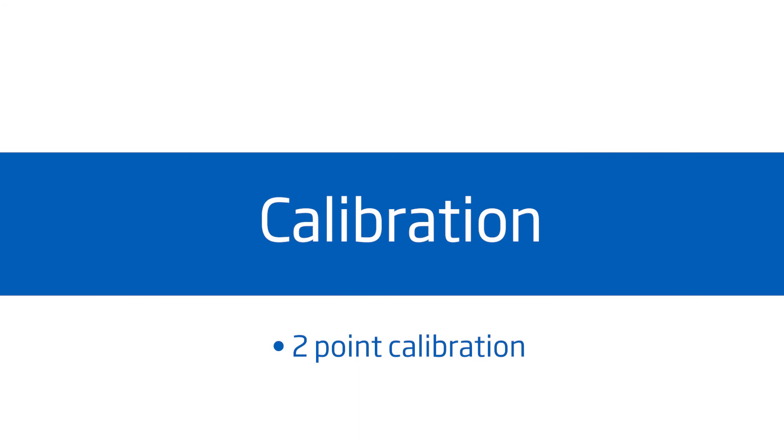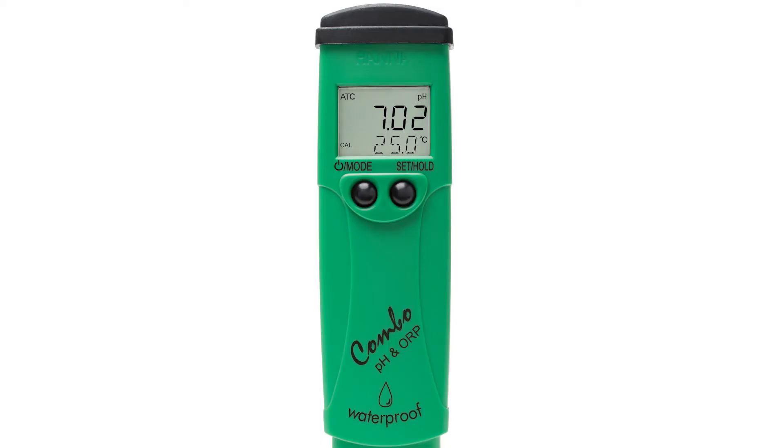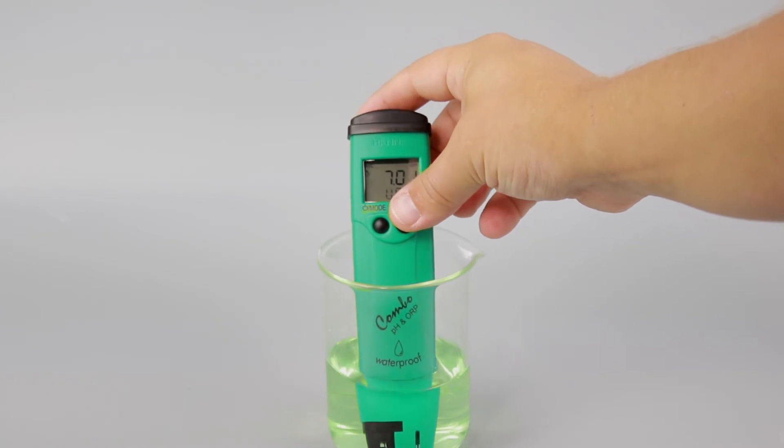Calibration is an important part of keeping your tester operating at its best. We recommend calibrating before each use. To calibrate your meter, press and hold the mode button for three seconds until cal is displayed. We recommend a two-point calibration. To do a two-point calibration, start by using the pH 7.01 buffer; otherwise, the meter will perform a one-point calibration and return to measurement mode. Place the electrode in your 7.01 buffer.